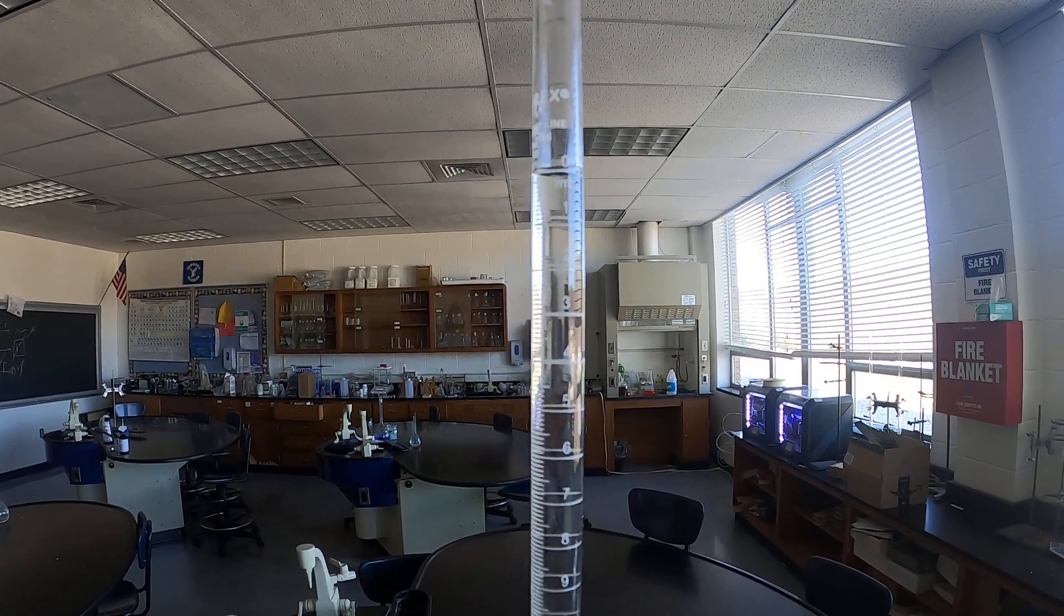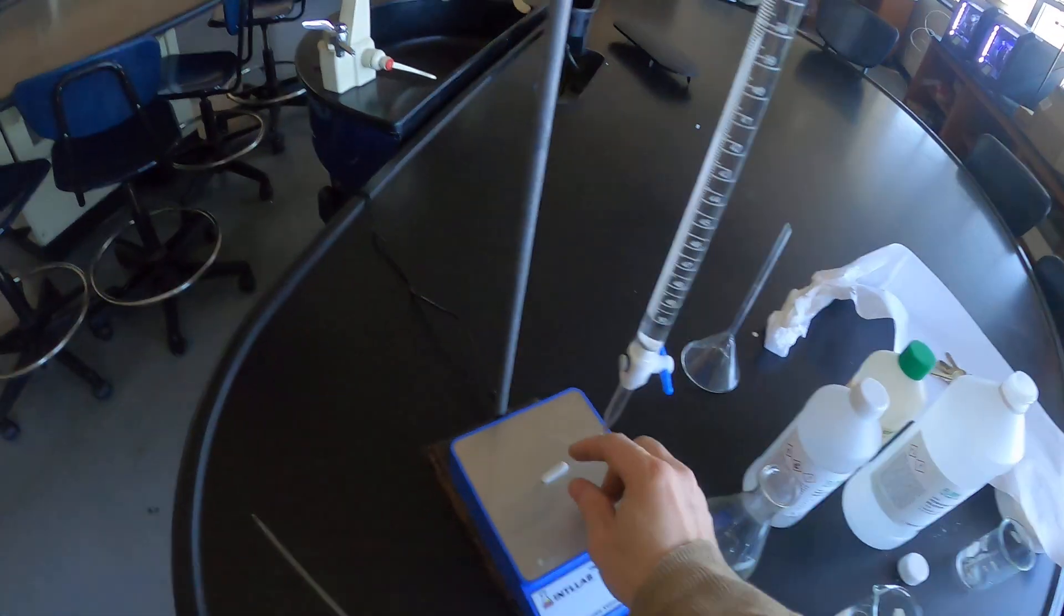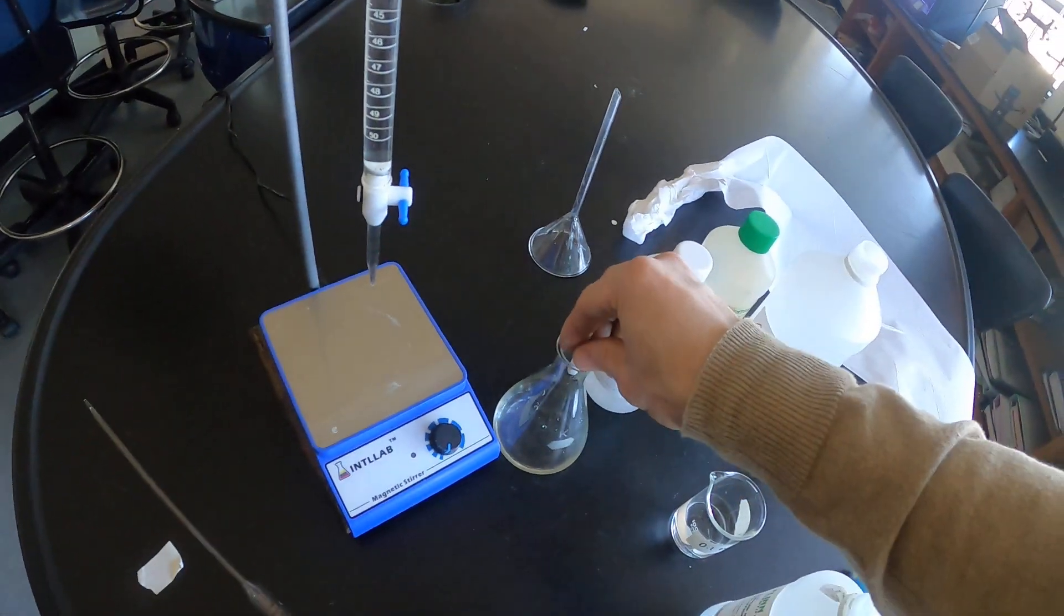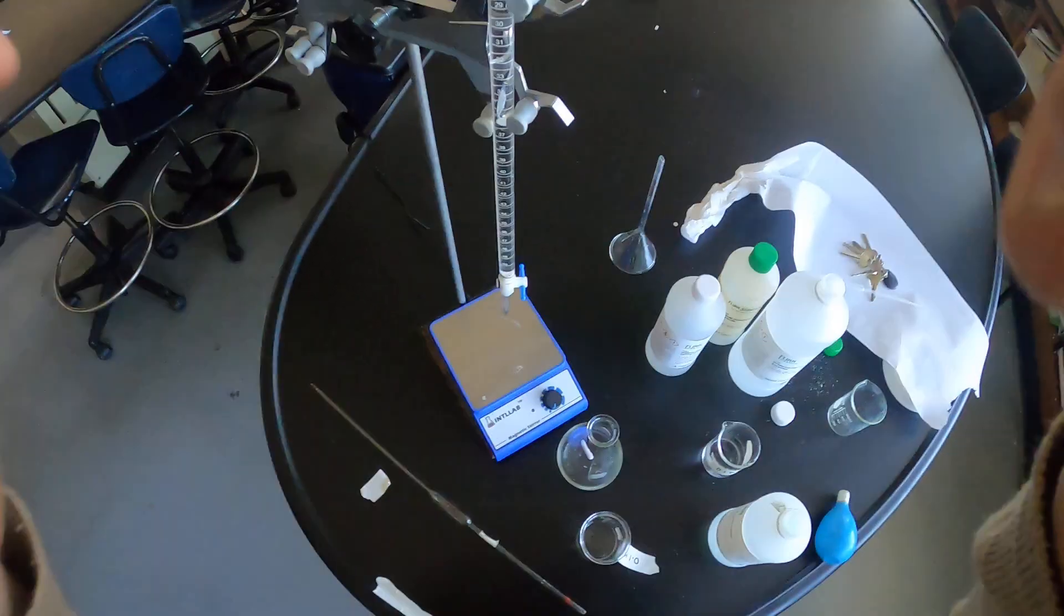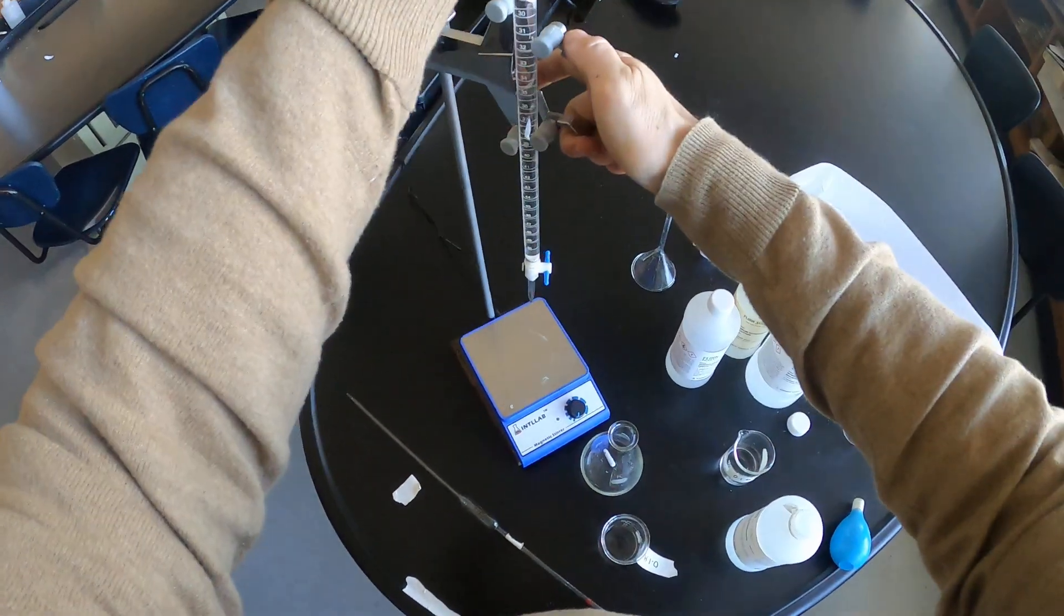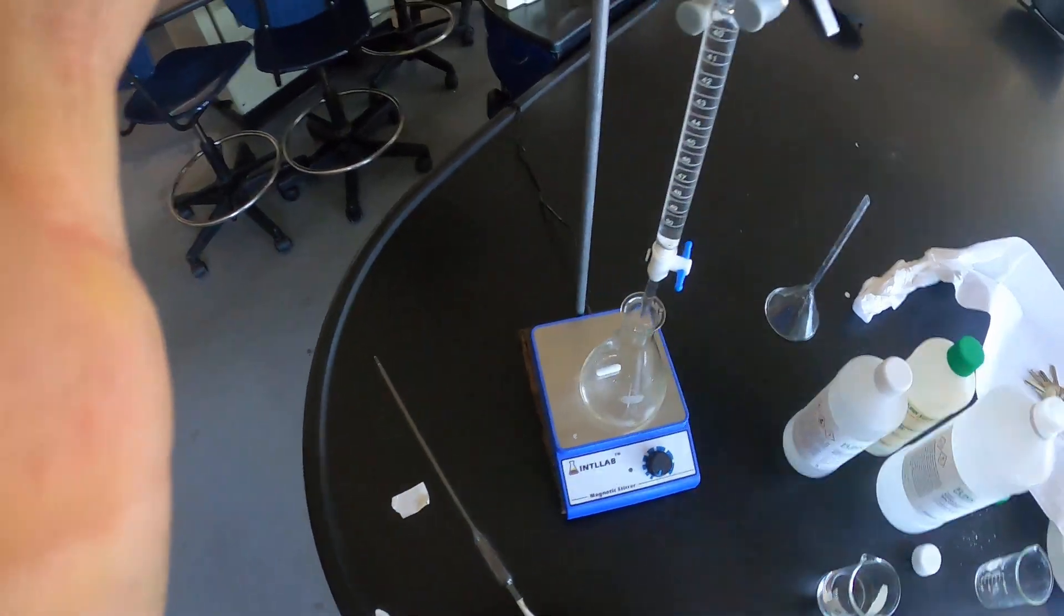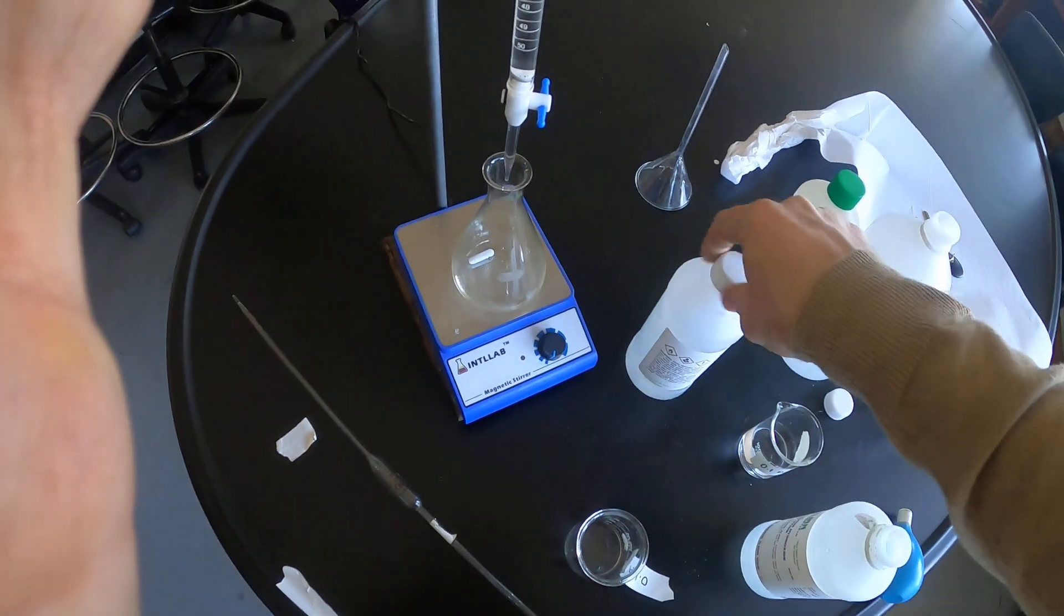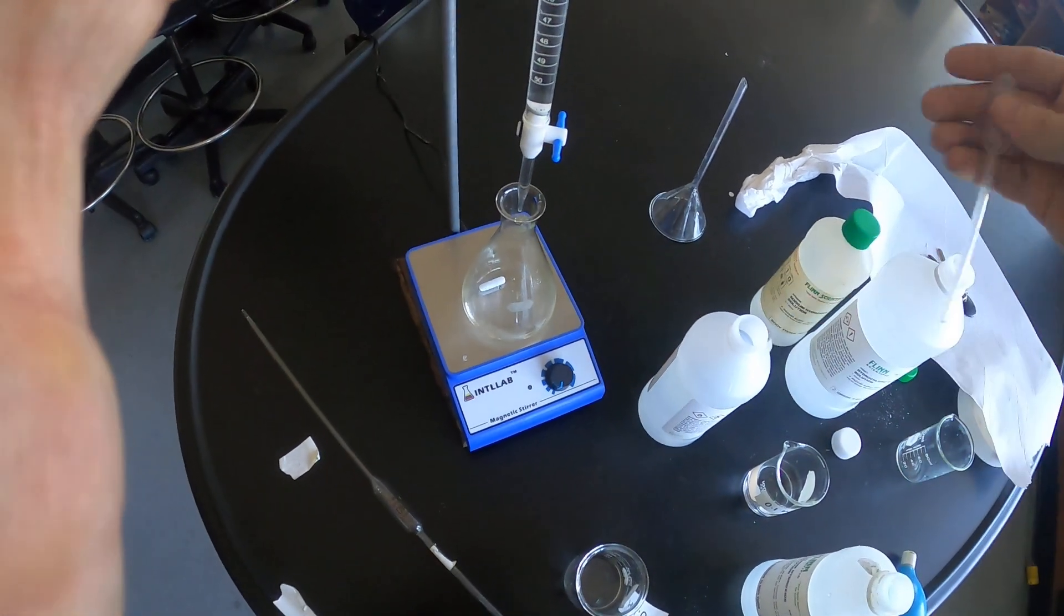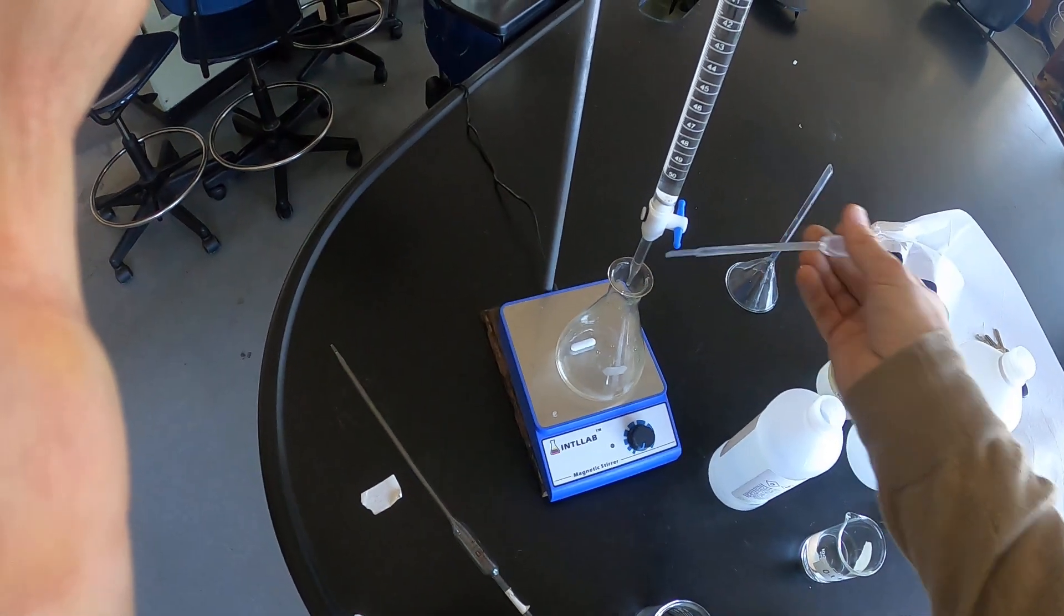Into the flask goes my stir bar and a few drops of indicator. Pour some indicator out into your beaker, so do as I say not as I do for this one.